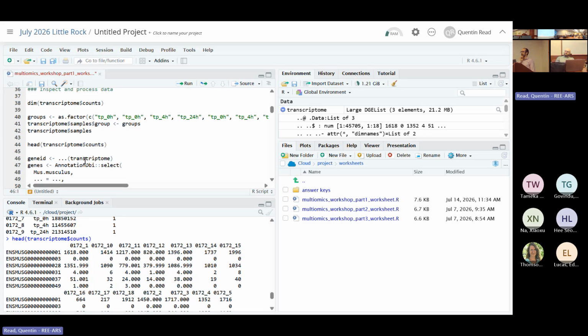Now, the good thing about working with mice is they're very well understood in terms of their genome. So we already have annotations that will tell us what some of these genes are, like what protein they code for. There's an R package that contains that annotation database for mice, and we can pull out that data and associate each of these numeric IDs with an actual protein that the gene codes for, which may be useful when we're looking at which ones are differentially expressed later on.